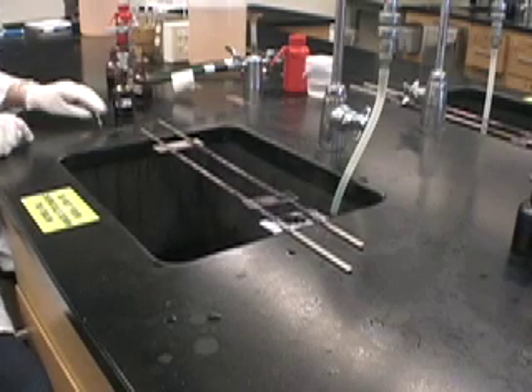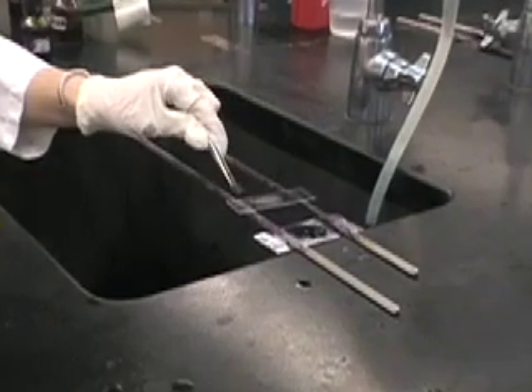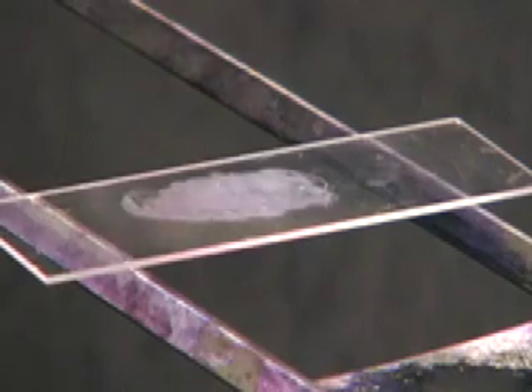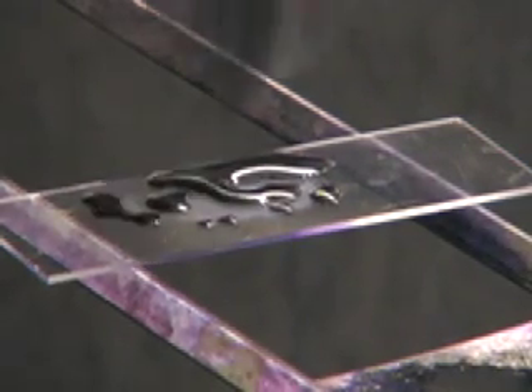To begin Gram staining, you'll start with a heat-fixed smear. What you'll notice is the film on the slide is thin, and you'll place your crystal violet over the entire smear.